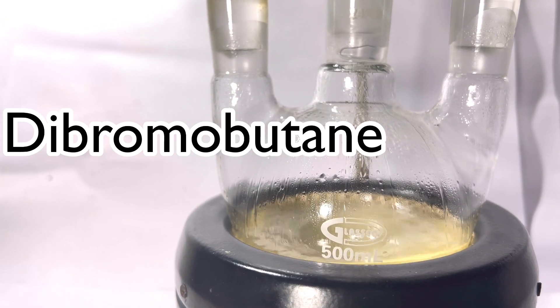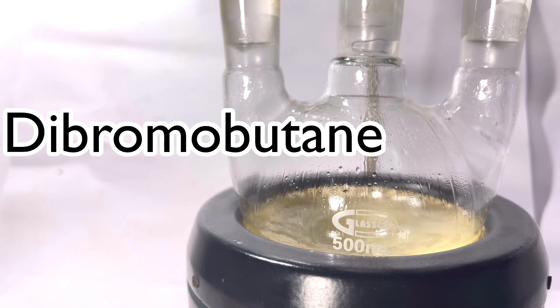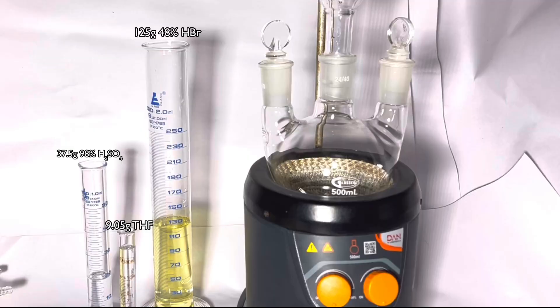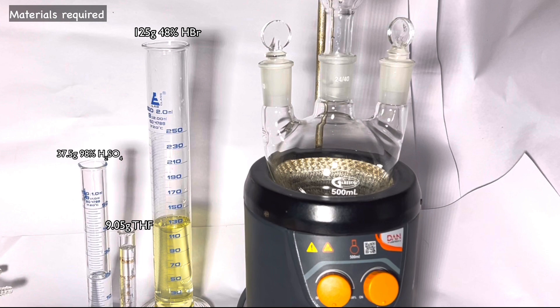The synthesis was adapted from Vogel's textbook of practical organic chemistry. For this synthesis you will need 125 grams of 48% azeotropic hydrobromic acid, 37.5 grams of concentrated 98% sulfuric acid, and 9.05 grams of tetrahydrofuran. I have taken half the stoichiometric amounts mentioned in Vogel's.